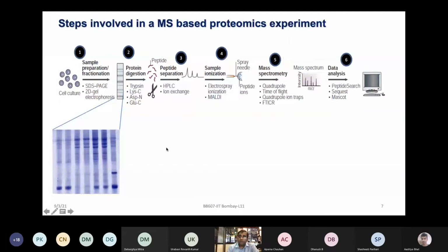So now refresh your workflow, which we talked about in mass spec based proteomics. We have talked by now about different ways of cell lysis and sample preparation, and doing quality control checks on the gel. So now you can see this kind of gel. And then we have been talking about this entire workflow. I hope now you can reconnect and recap the entire workflow of what we have been discussing and how things start and how things finish.